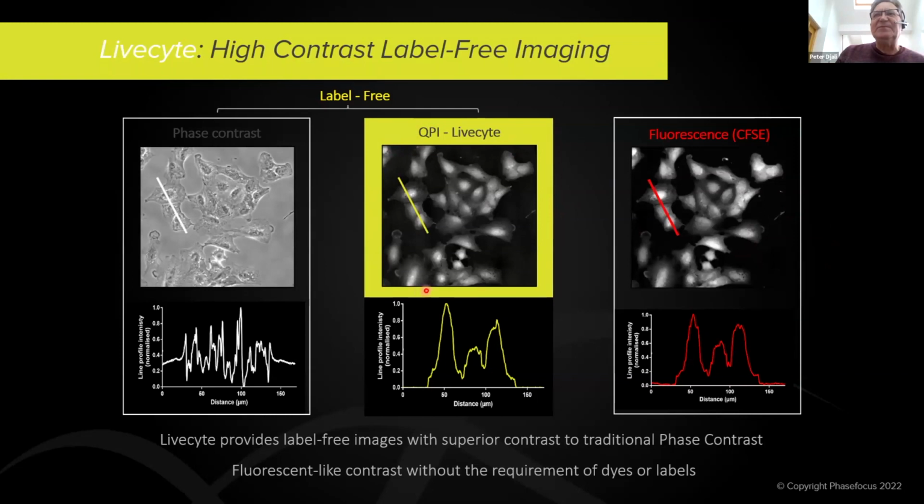This is what gives us the images that are really easy to segment, really easy to derive all sorts of phenotypic parameters from. But the beauty of this is it's completely non-invasive, no labels, no special preps, and the cells stay alive. If you image CFSE, it's one of the most phototoxic compounds on the planet. Great for flow cytometry, but your cells will be dead within hours.